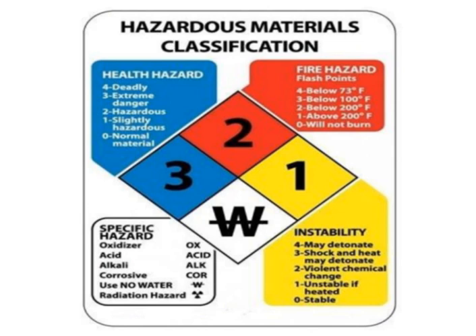Red, makes sense that red is for fire hazard. Basically what it's discussing is what's called a flash point. A flash point, if you've never heard of this before, is the temperature at which things can spontaneously burst into flames. There are some things that, if they get too hot, will auto-ignite.